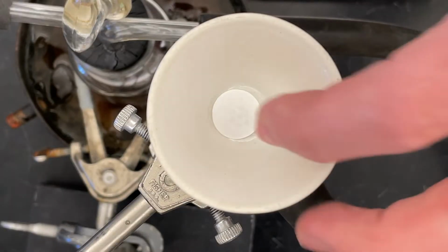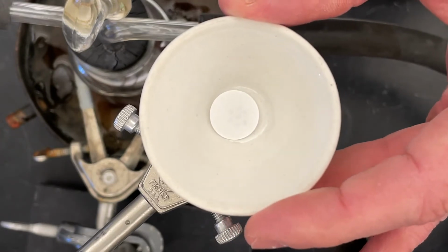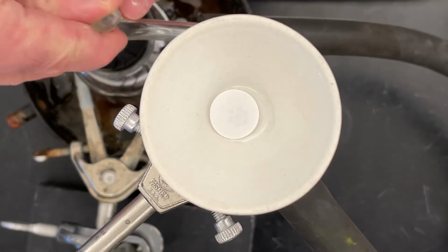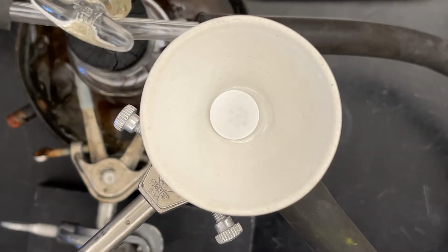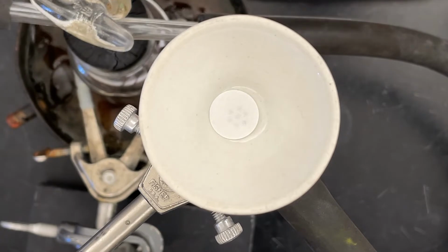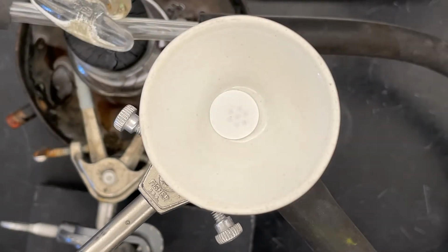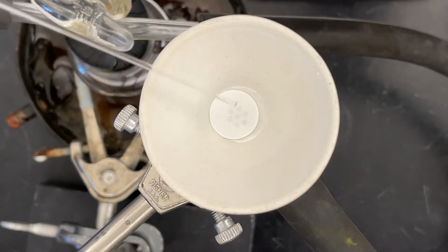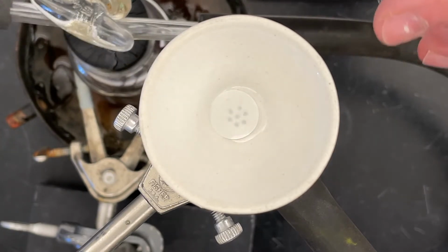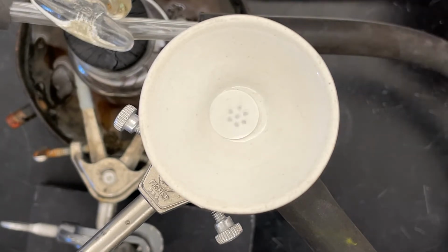Okay, I think I basically have the shot where I want it. So the paper's in there, and what we're going to do is close the apparatus, turn on the vacuum, make sure that that paper seats well. We're going to give it a little bit of water first. Wetting the filter paper helps the filter paper to stick down so that the crystals don't go underneath it.